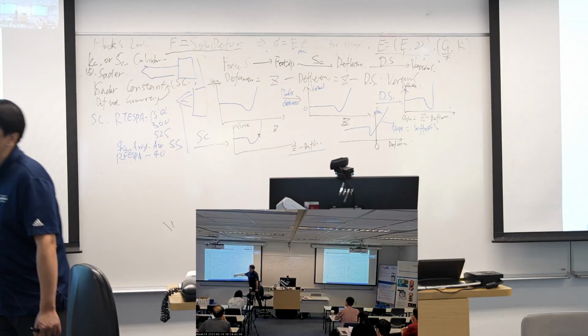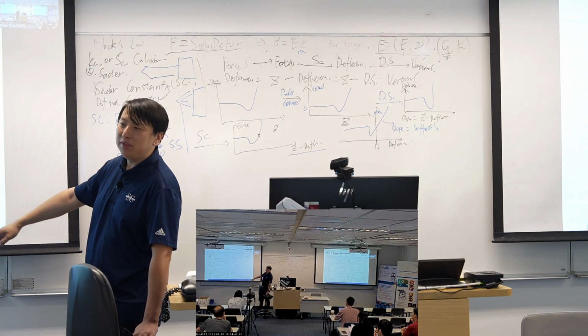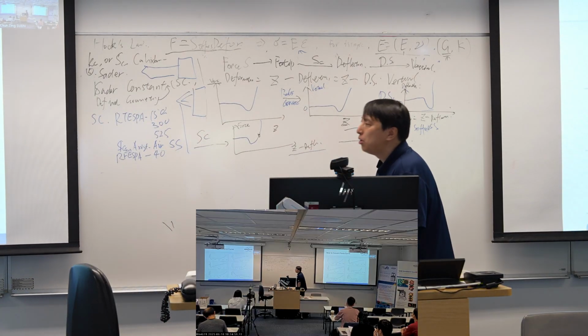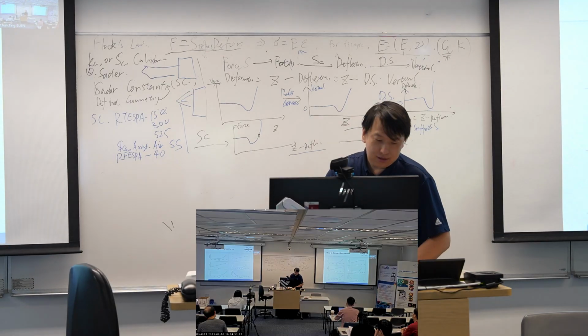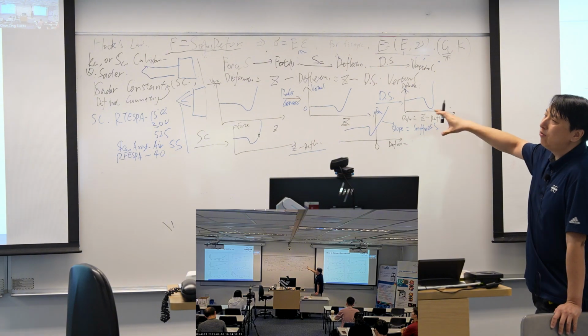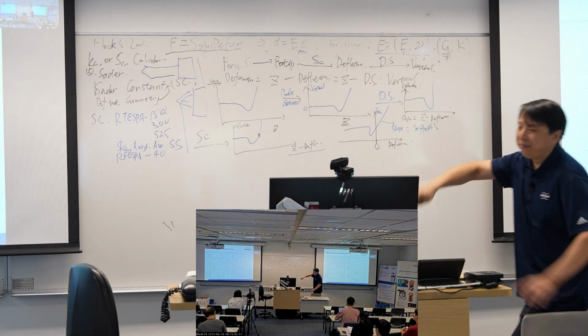And in this kind of formation, the x-axis now, Bruker gave it a name of separation. And now the scientific information is, I think, kind of loose in Bruker's expression.